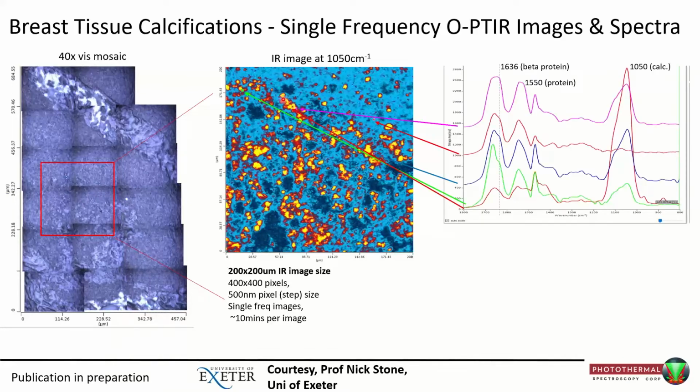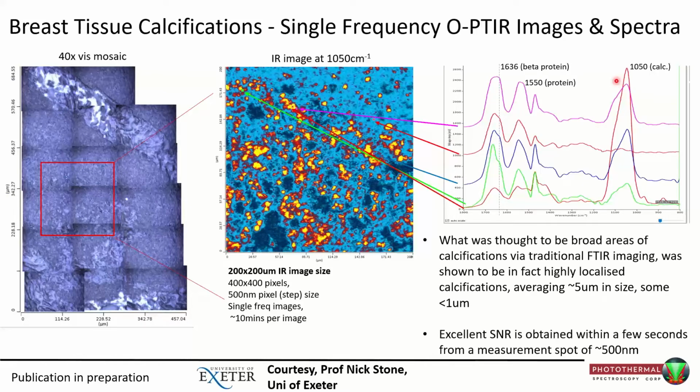And then when you go in there and target some of these points and the points in between, you can see again the origin of the chemical contrast. And the spectra, of course, become a lot more pure, quote unquote, because there's no spatial blur.